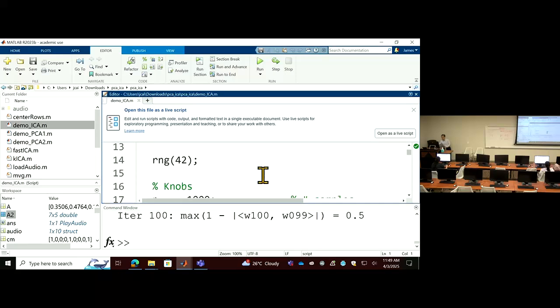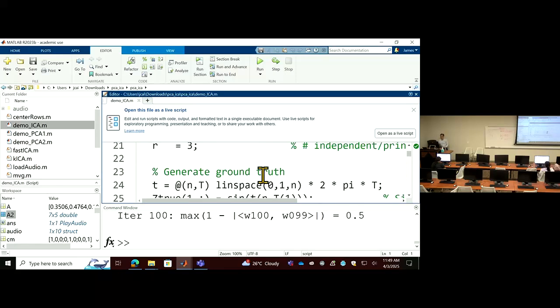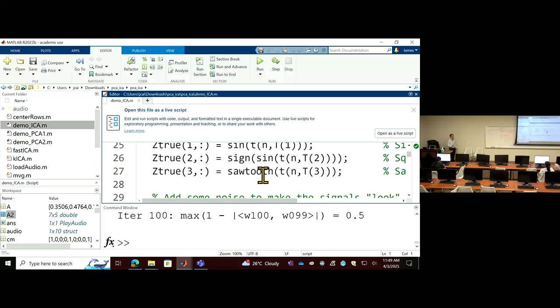Maybe some of the smoothing functions require the signal processing toolbox. MATLAB is a very strong package for signal processing and has the functions built in.